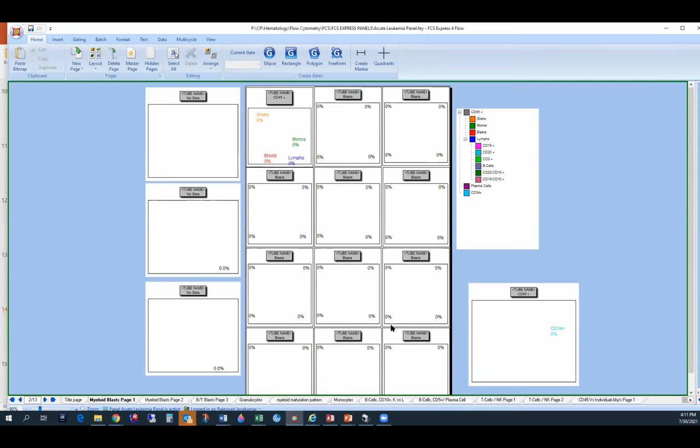So we have fixed templates in there where you will import your raw data. Raw data is only gray color or black color. You will have to color it based on your gates to highlight the population you want.